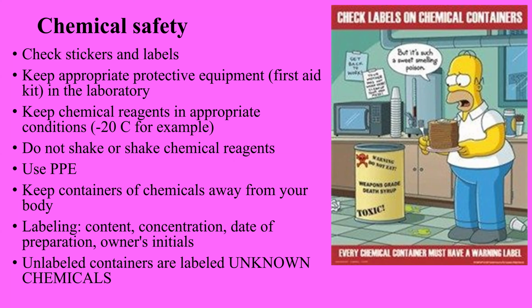In big labs, if you prepare some buffer or some solution, you should label it with the content, concentration, date of preparation, and who made this solution.